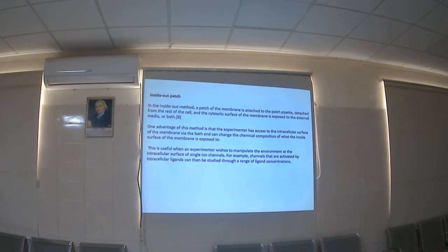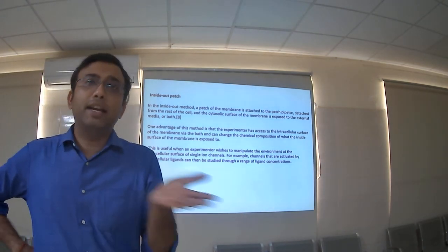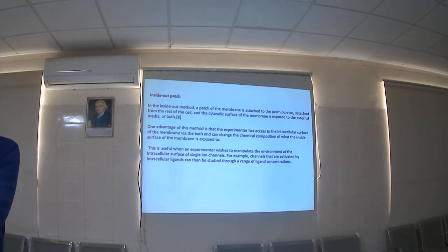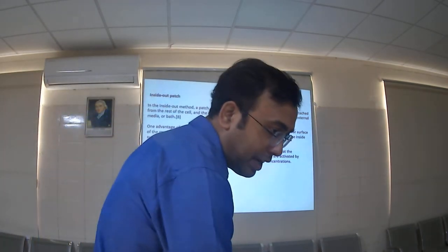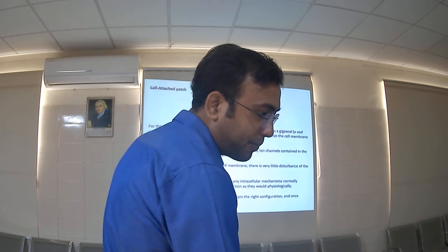ठीक है? And this is useful when the experimenter wishes to manipulate the environment at the intracellular surface of a single ion channel. For example, last example, just concentrate. For example, channels that are activated by an intracellular ligand can be studied through a range of ligand concentrations. So ligand concentration is one of the ways to study the ion channel, right? कि अलग-अलग ligands किस तरह से, how it is actually affecting the cellular concentration, cellular electricity. ठीक है? And last is the whole cell recording.